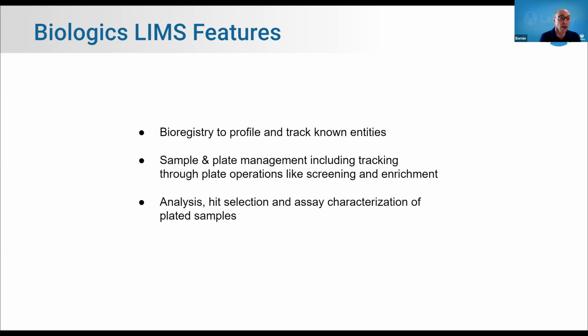So, LabKey's Biologics LIMS is a very powerful product that is as complex as the science that it aims to serve. I'm going to show you a few aspects of the product today in order to paint a picture regarding the way that you can do some of this kind of screening and characterization. I'm going to start by showing you a little bit about our bioregistry, which you can use to profile and track known entities, which are ultimately generated throughout the process.